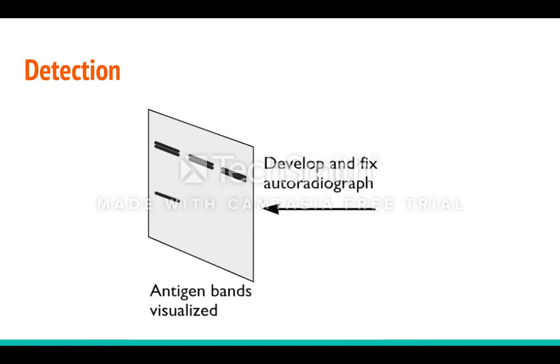The fifth and final step, which is the detection step, is where the film must be lined up with the membrane in the exact same manner that it was exposed, because the film does not tell us where the lit bands are located in relation to the membrane. After this step, the membrane will be stained so the protein can be visualized and compared with the film.